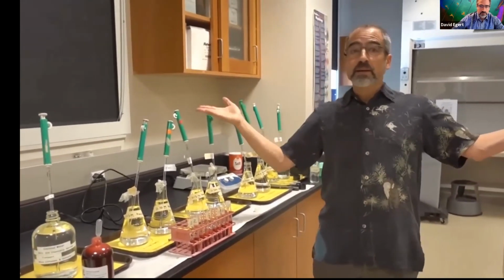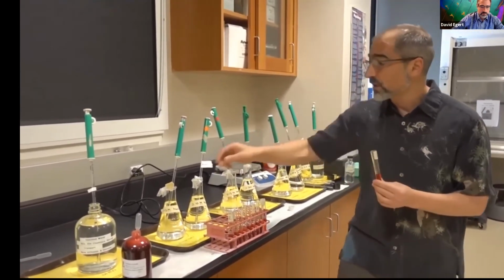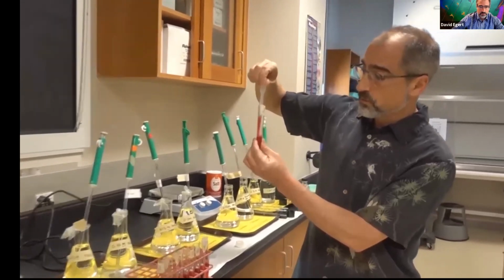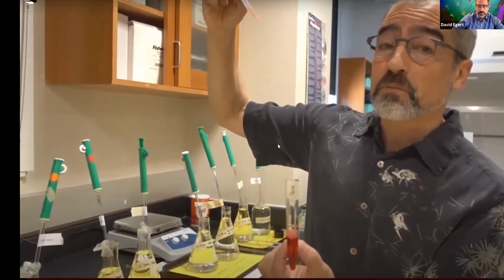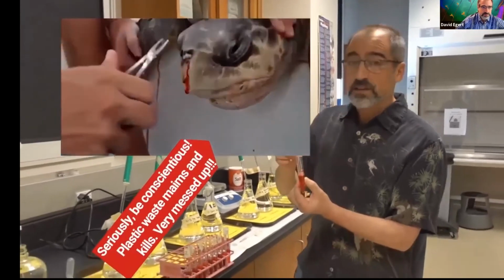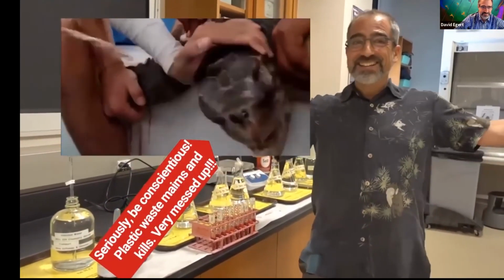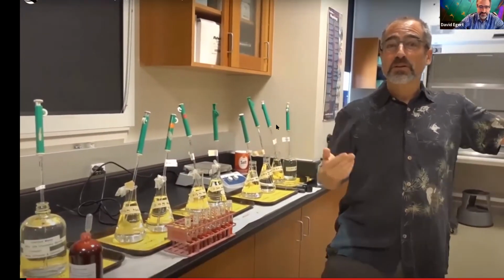And the next step is going to be, make sure these are well mixed. If they don't look well mixed, you can use a clean pipette and really make sure they're all mixed up well. And then obviously you're not going to use this for anything else anymore because it's going to cross-contaminate. So this is now plastic waste. Hopefully it doesn't poke the nose of a turtle in the ocean or something. All right, that is that. So next we will get a tour of the centrifuge.